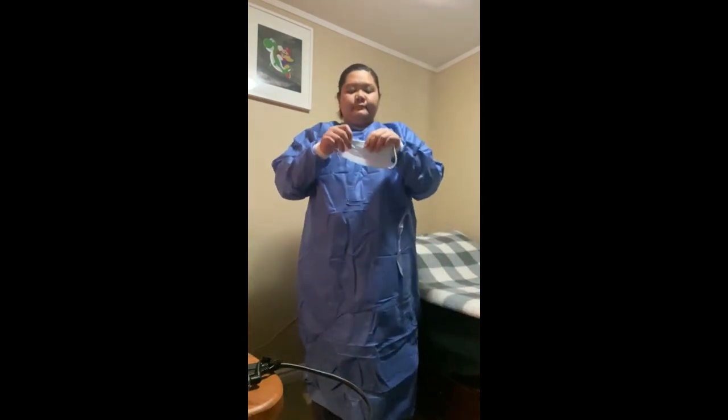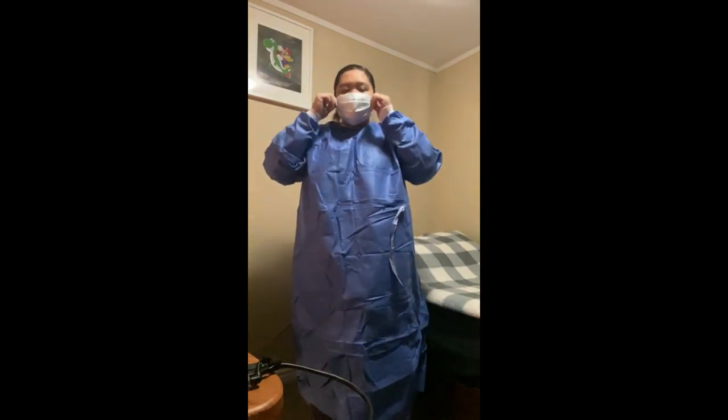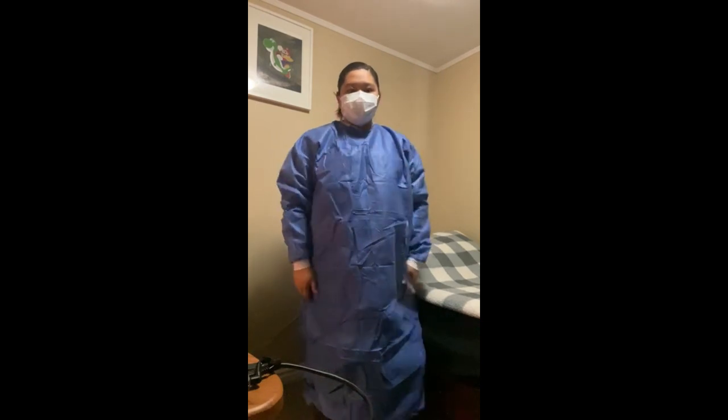Next, put on your mask. Secure the mask or respirator over your nose and mouth, ensuring a snug fit. This protects your respiratory system by filtering out airborne infectious particles.